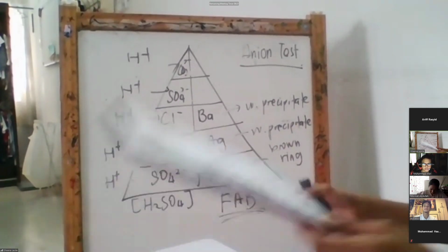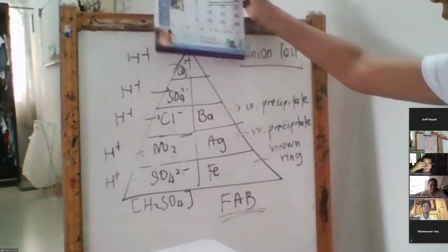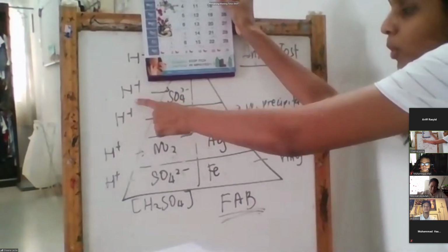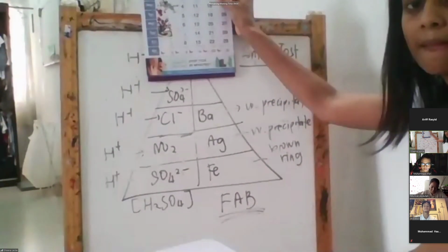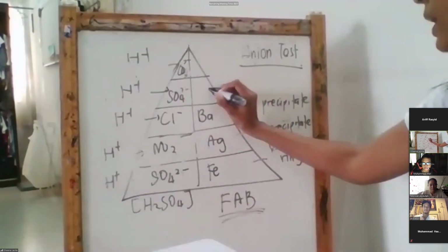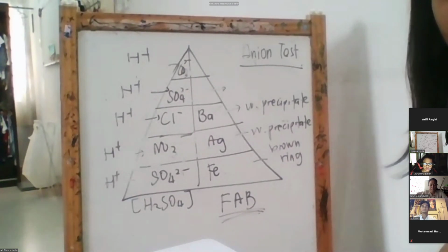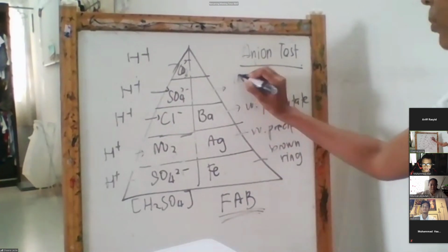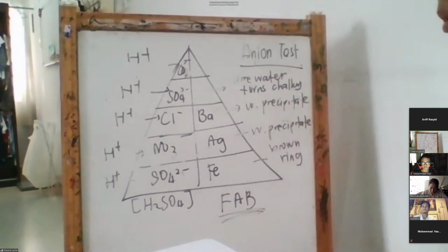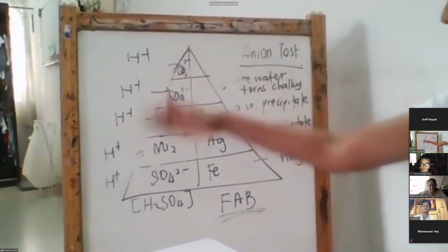Yes. Okay, good. And then I want to test for my carbonate here. This is the question that Bhuvanesh asked yesterday, okay? I want to test for a carbonate. So I close the carbonate and I look at the bottom of it. I only have one thing. I'm only adding what? An acid, correct or not? Yes. Okay, so I'm adding sulfuric acid. It can be any acid actually, but I'm adding sulfuric acid. And what am I going to get, class? Add with lime water, then it will turn chalky. Here your lime water will turn chalky, or you can actually say gas bubbles are produced, because carbon dioxide is being released.